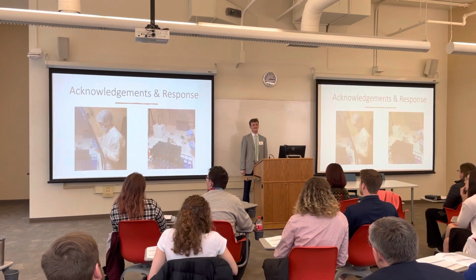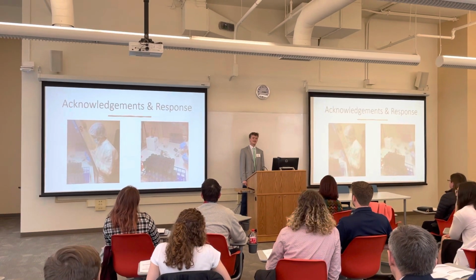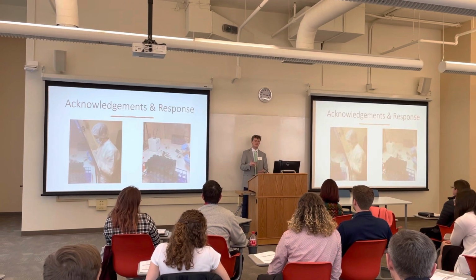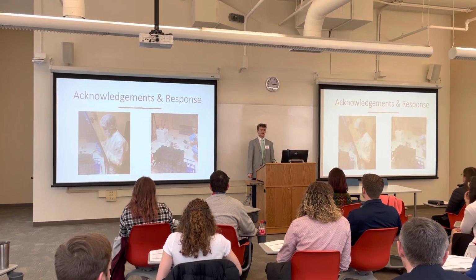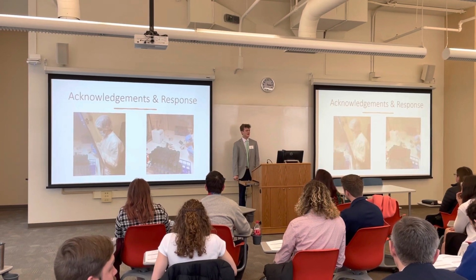Tyler, do you add antifungals? No. Why not? We tend to get a major contaminant? Yeah, it tends to interrupt, is the problem. It interrupts the cell cycle of the plant. When you're coming to rooting and shooting with the auxins and cytokinins, they don't like each other. They're too closely related metabolically. Right, they don't like each other.